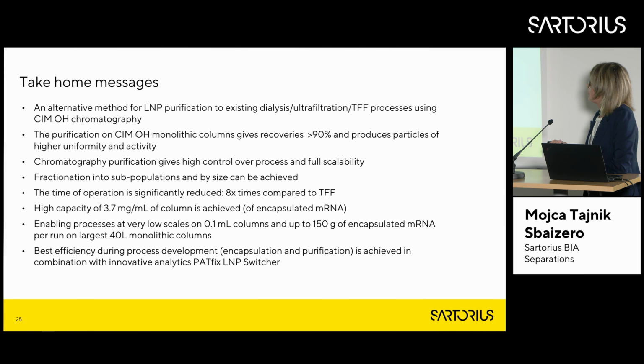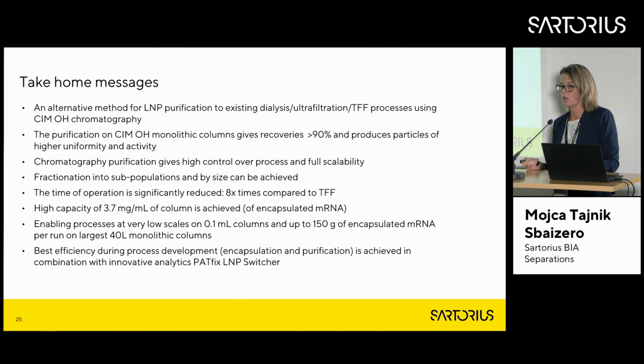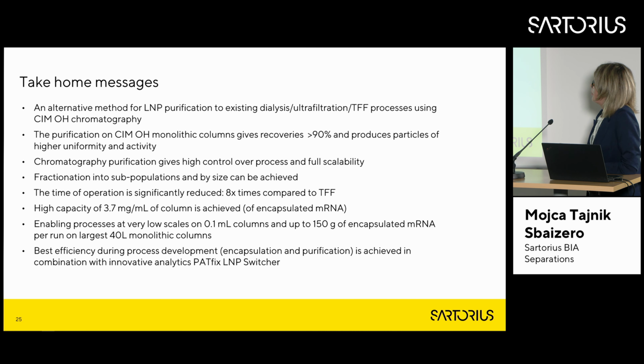The time of the operation, I haven't really mentioned that, but you could see already in the previous presentation that chromatography with monoliths is fast. And also the capacity is very high, so you can get a high percentage of the encapsulated RNA in the final sample.